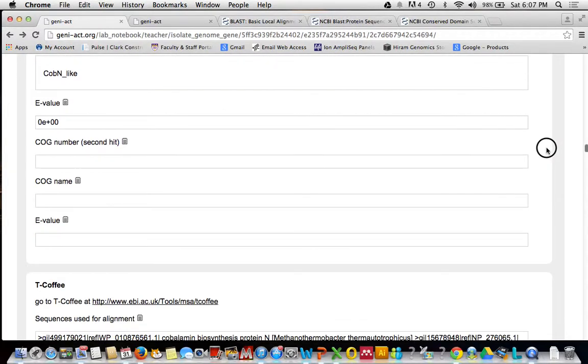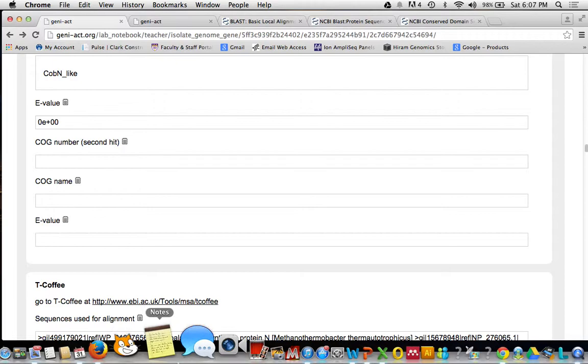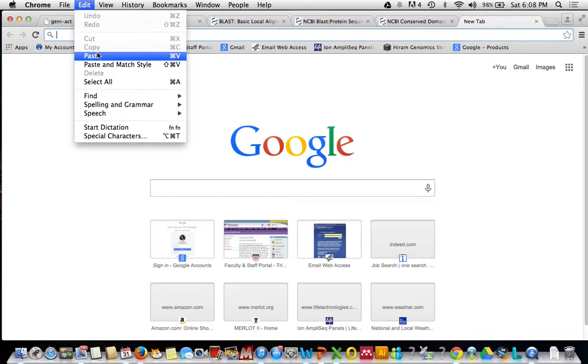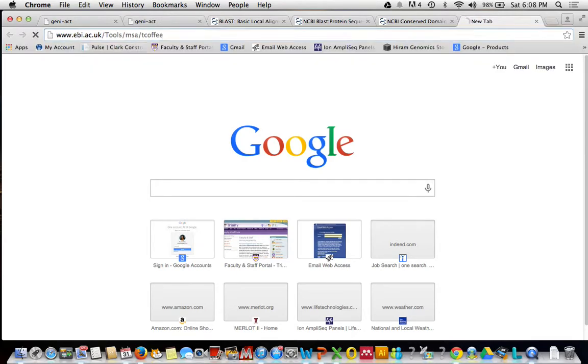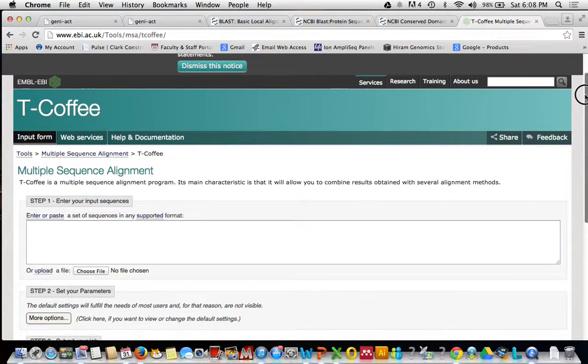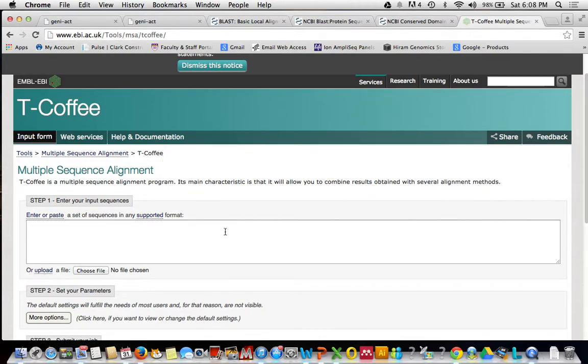Okay, let's go back. So what you need to do is you need to go to T-Coffee. So what I'm going to do is I'm going to copy and paste this. Edit, copy, the new tab, edit, paste, and that should take me to the T-Coffee server. Now what T-Coffee will do, it will align these 11 sequences.